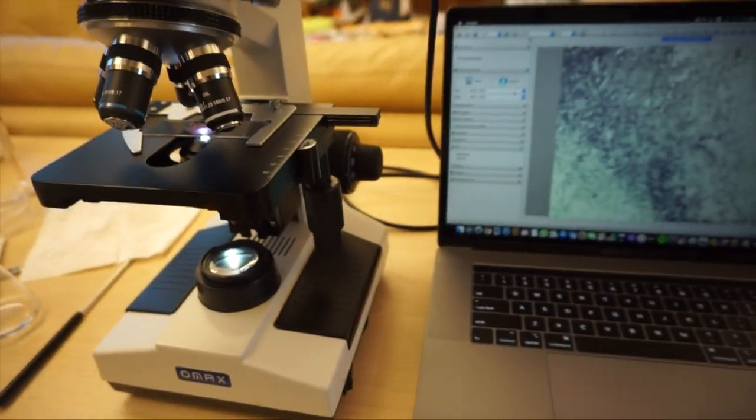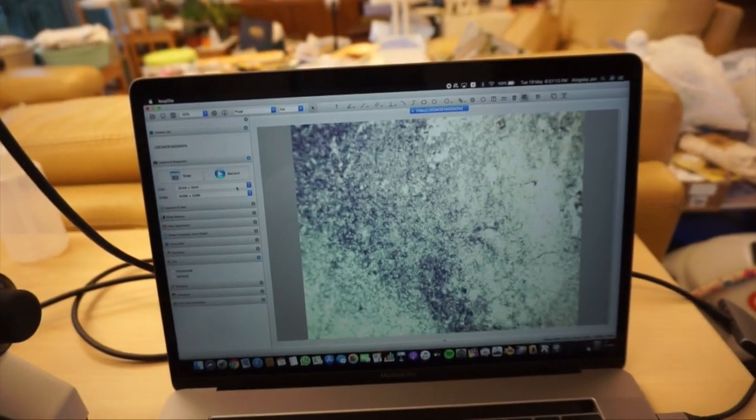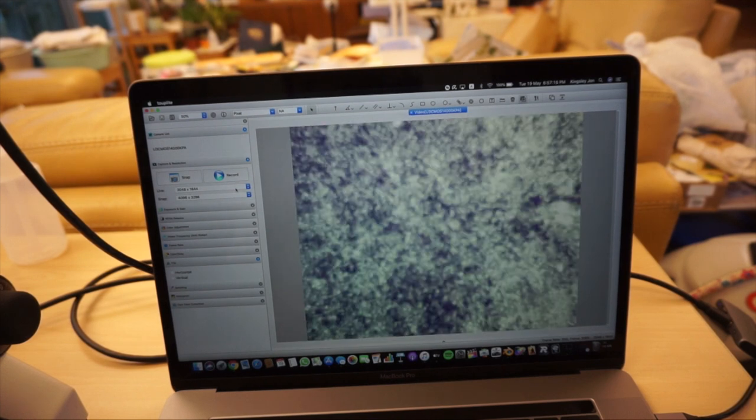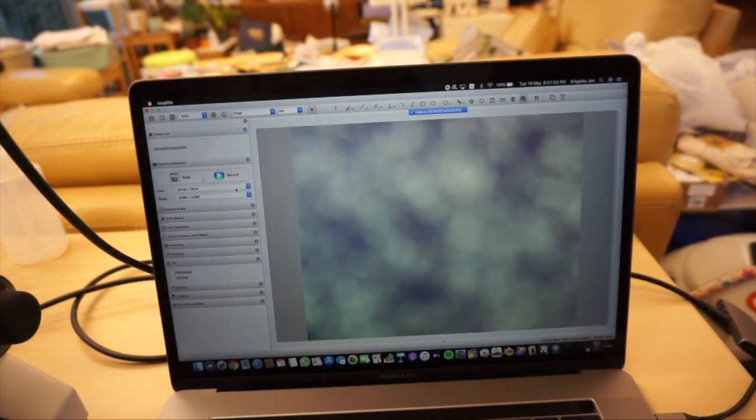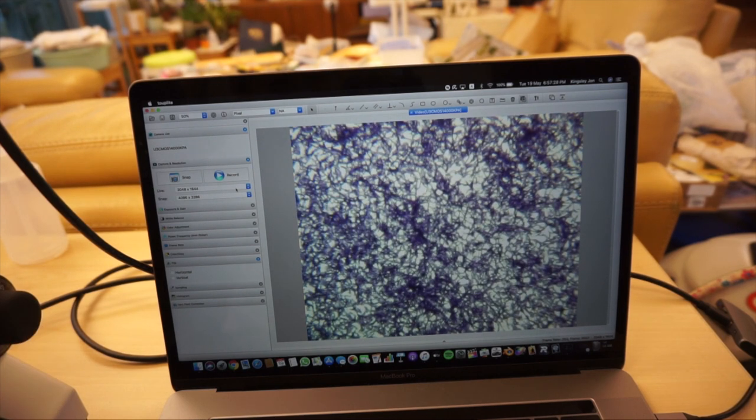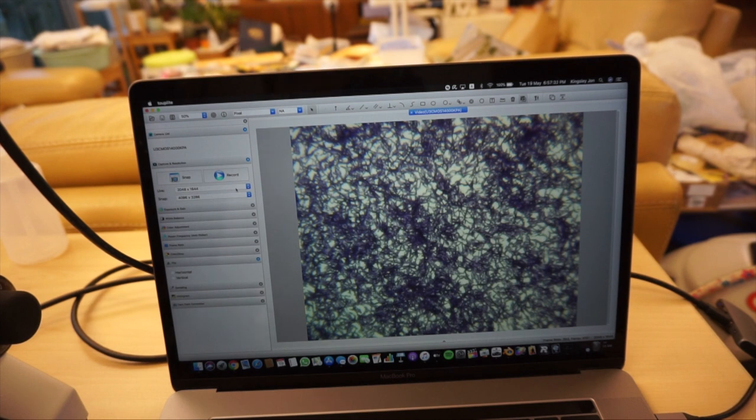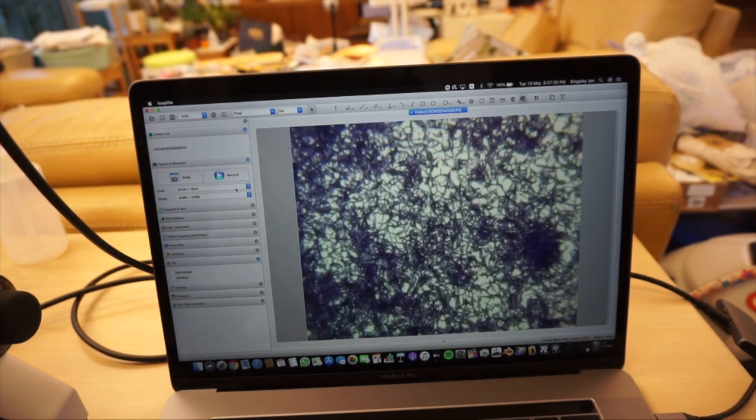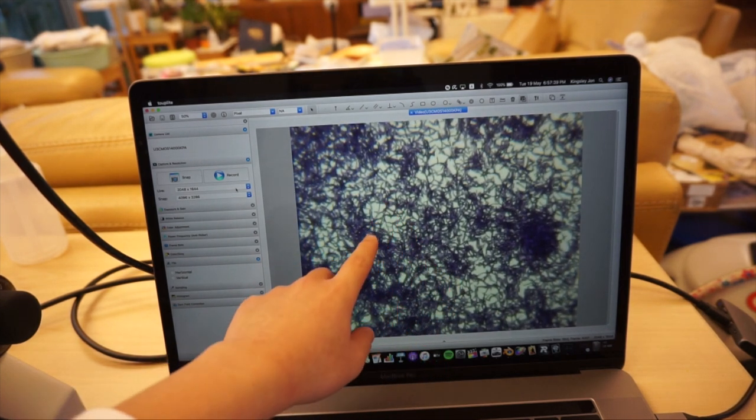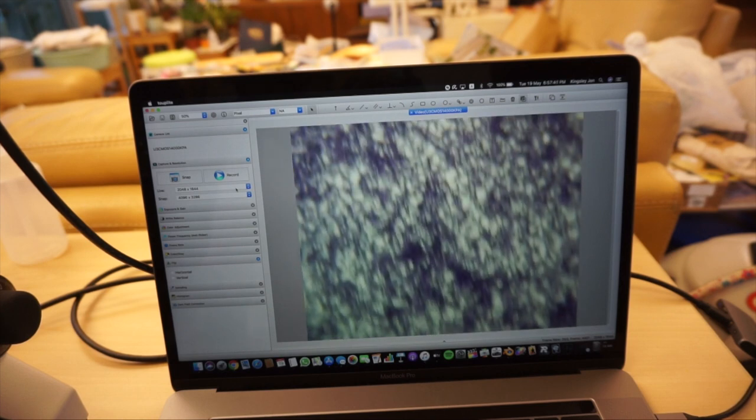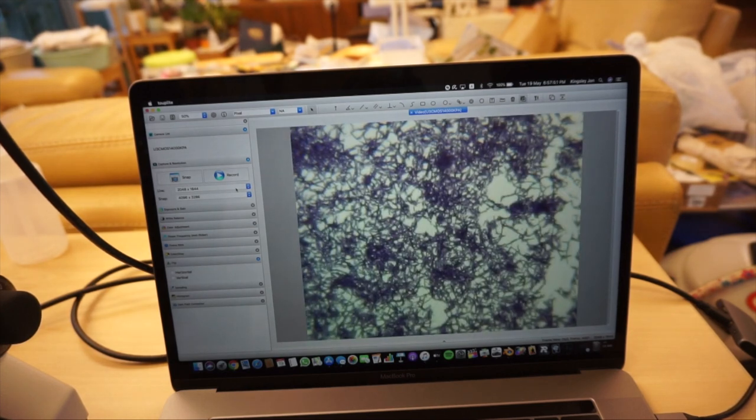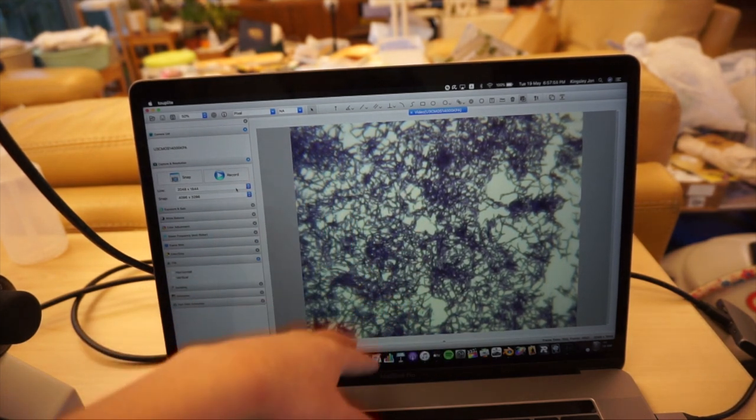Look real clear in the objective. But I can't put the camera on top so I can't show you inside the objective. But I can show you here. So here is 4X. Here is 10X. Here is 40X and here you should be able to see the bacteria. Our bacteria is visible. You can see that it's a bit blurry. There's too much bacteria on it. Next time I'll actually, it's a bit unclear here because the resolution right now is not very good. So you can't see a single bacteria. But I will take this and project it into the video sometime in the future.